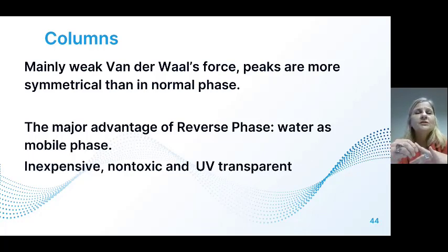And what is important is that it is UV transparent. If we use something like acetone and hexane, it is not UV transparent, and therefore you can't use a UV detector. So it is in water. The reverse phase is the preferred separation at this stage.